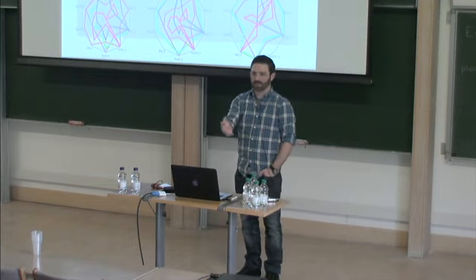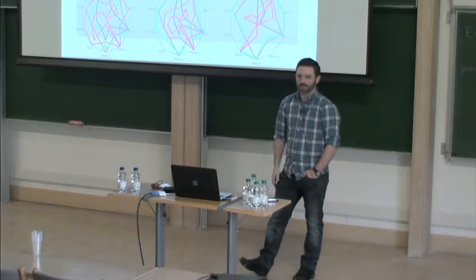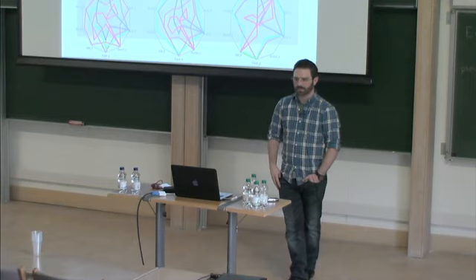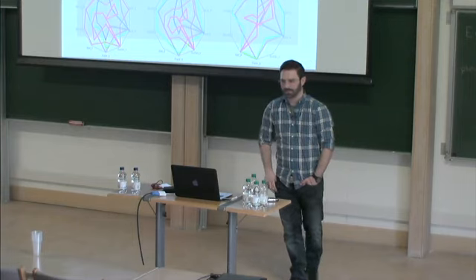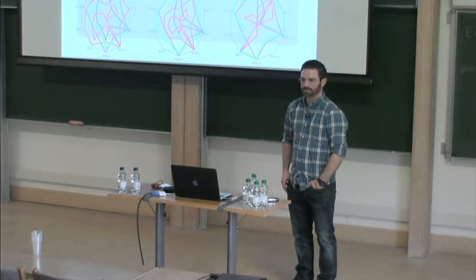Which is how some of these methods do it, like some of the k-mer-based ones, like CLARK or Kraken. That's how they do it, like the Lindgreen study that you showed. They also did it like this. And that's the natural way. But maybe it's also another incentive to think about how to do it better.